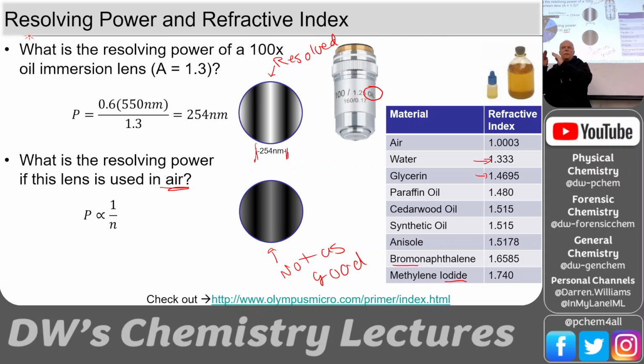So it's quadrillions of absorptions and re-emissions is a way to think about it. Okay, but it's not really a good analogy, as there's no energy level where the electron can hop to if you're not on a transition wavelength. So it's really like a virtual level, kind of like Raman scattering. We have the dashed line at the top. It oscillates with the electric field and then scatters it off. Okay, so if it scatters off at an angle, we call it Rayleigh scattering.